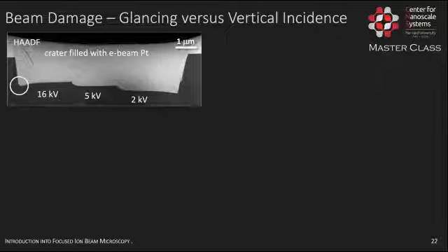For example, if you think about silicon, the main effect is amorphization, but amorphized areas don't produce major contrast in a TEM image. So you can, in principle, overlook the problem. This is not the case in the example that I show you here, which is sort of an extreme case, a warning sign for everybody who is doing transmission electron microscopy. This is a two-phase material made out of zirconium oxide and yttrium tantalate, which was done in collaboration with David Clark at Harvard.